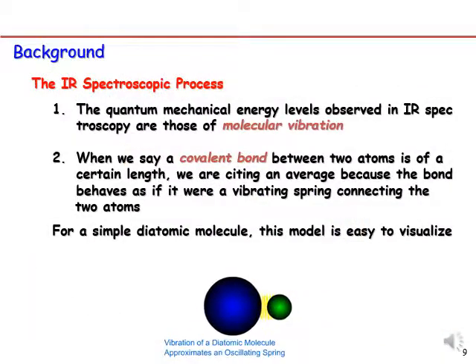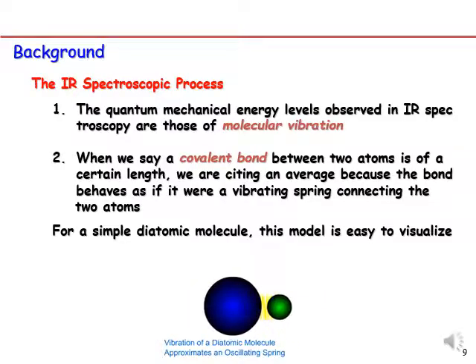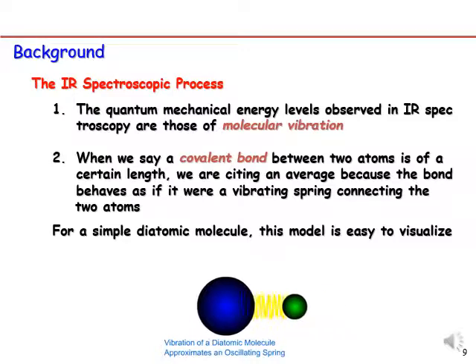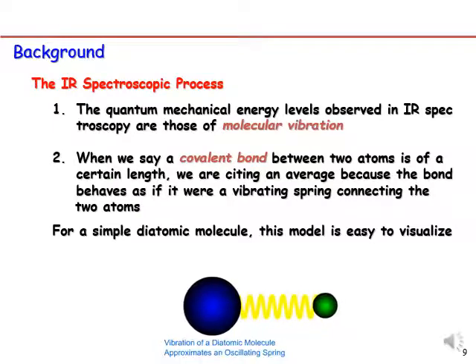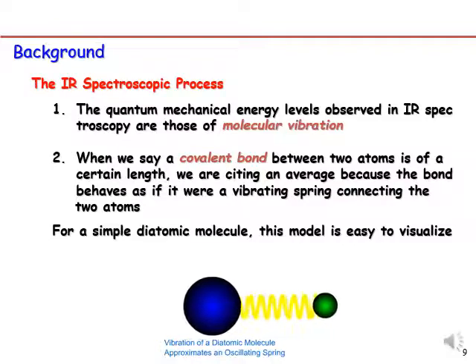When we try to understand the IR spectroscopic process, you already understand that IR spectroscopy depends on molecular vibration, and thus this instrument can differentiate different kinds of functional groups in the sample or in any kind of solution that is being tested.